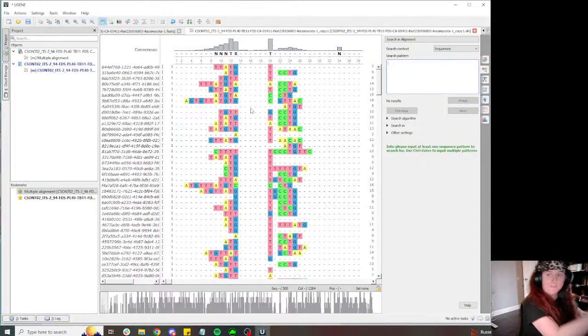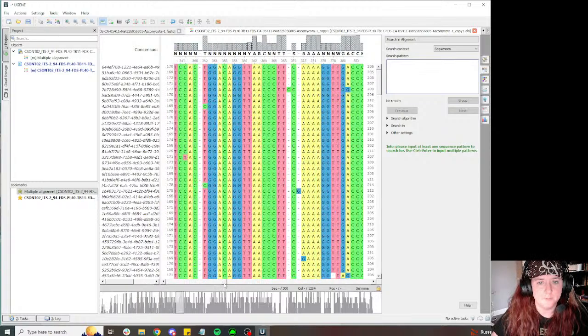I literally just have boxes of mushrooms over here that I have to get around to sampling, but I've been too distraught to do anything about recently. Okay. Anyway. Yeah, if there's too much DNA, it'll totally clog the pores. So yeah. So basically, yeah, the distraught's not good.